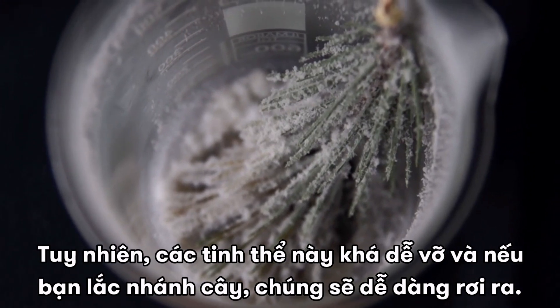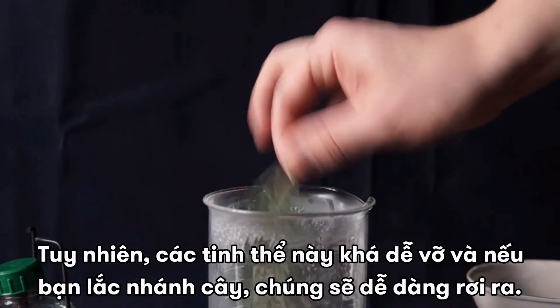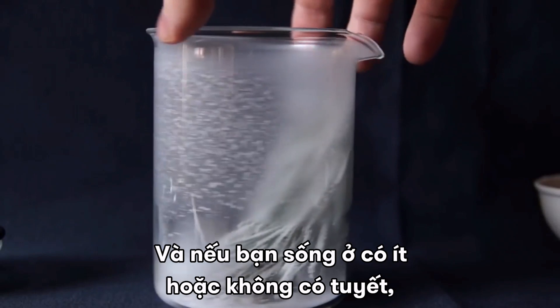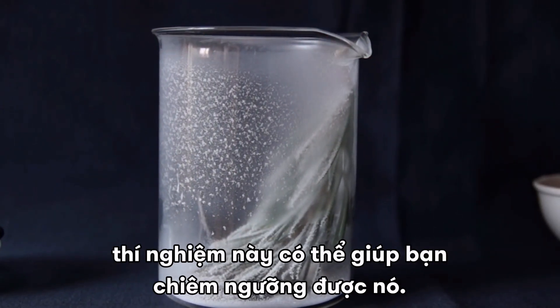However, the crystals are quite fragile, and if you shake the branch, they will easily fall off. This experiment is very beautiful and spectacular, and if you live where there is little or no snow, it may help you to brighten its absence.